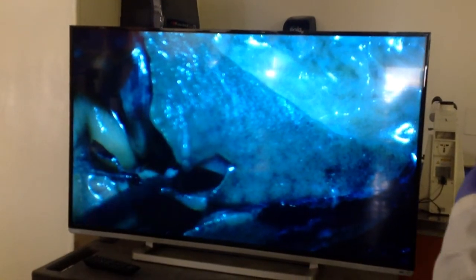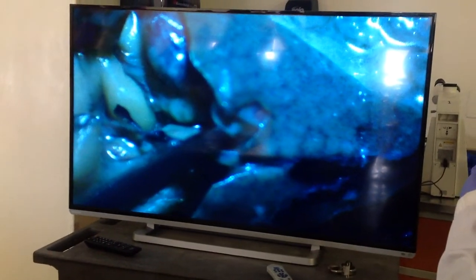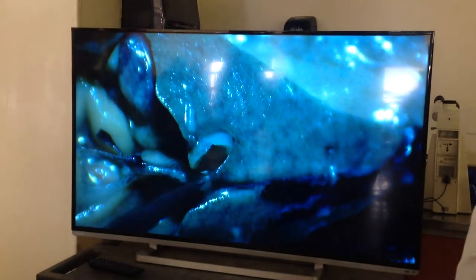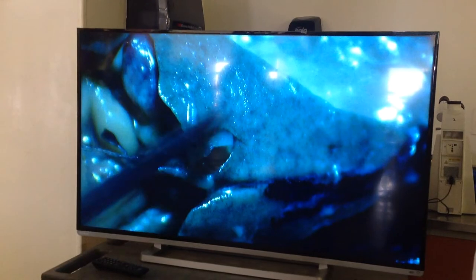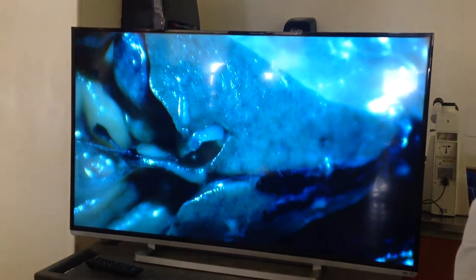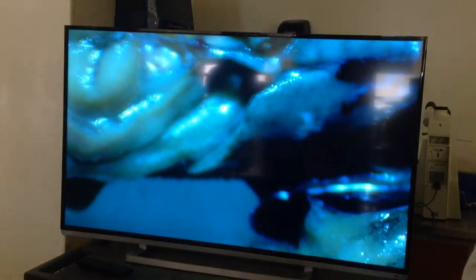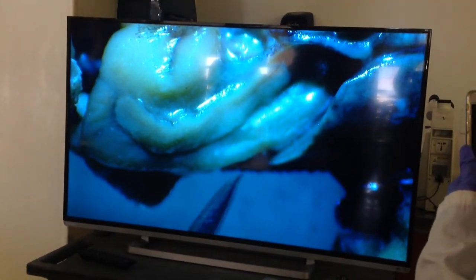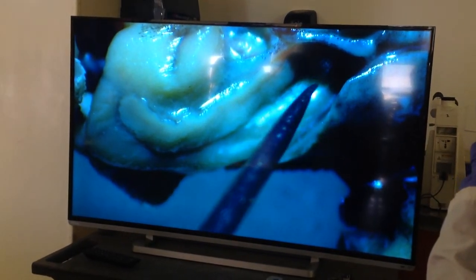Front here is the liver, and you can see the gallbladder right there. And that's the liver. I'm going to move down and keep going. And this is actually the stomach — right here, that's the stomach.